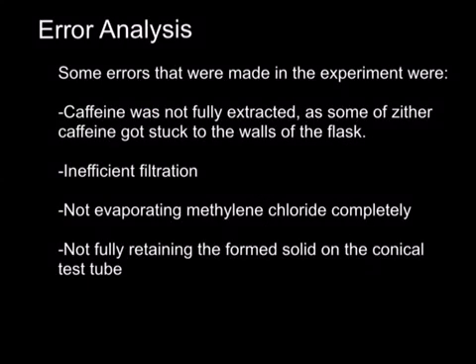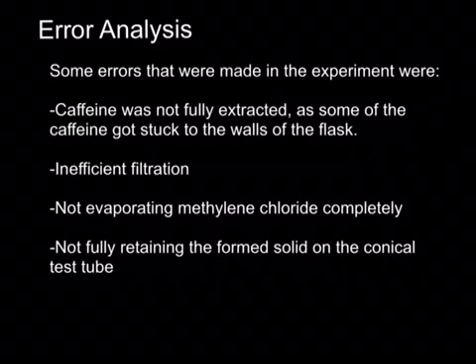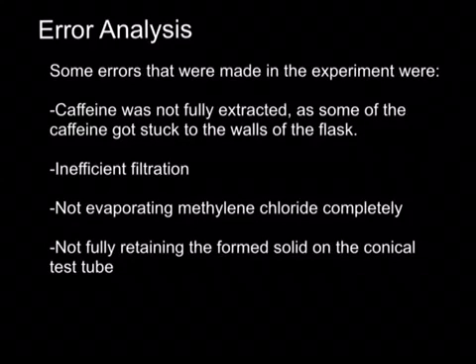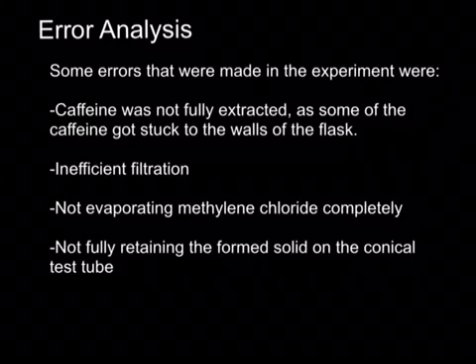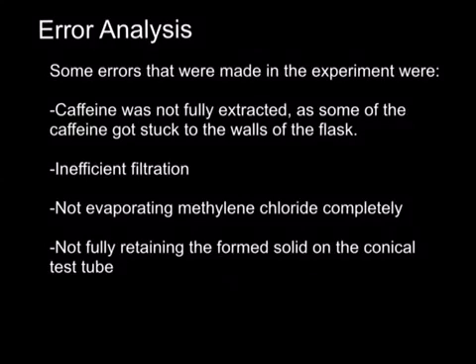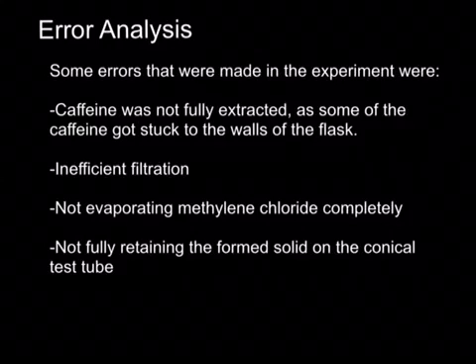Error analysis. Some errors that were made in the experiment: caffeine was not fully extracted, as some of the caffeine got stuck to the walls of the flask during sublimation. Other errors include inefficient filtration, not evaporating methylene chloride completely, and not fully retaining the formed solid in the conical test tube.